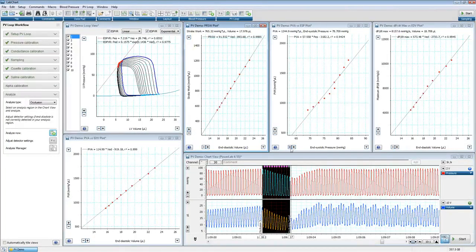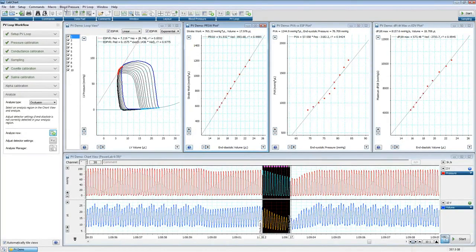And for each one of these windows, you'll notice we have a link to the help menu topic for them. And we can also tell our workflow here to automatically tile the views when we open them up. So as I keep pulling them out, I'll bring it in and it'll tile them.